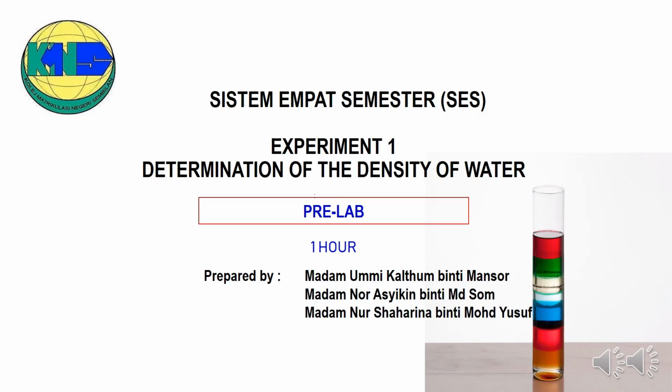Experiment 1. Determination of the density of water. Pre-lab.